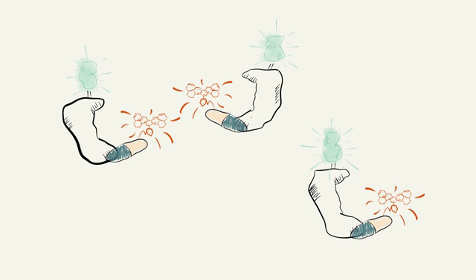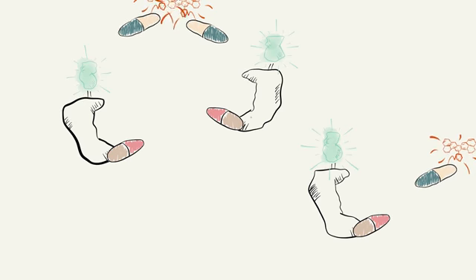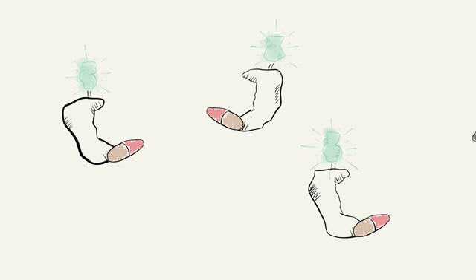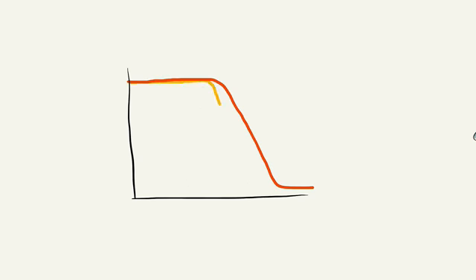However, if we introduce increasing concentrations of a drug that binds to the same target, we are able to compete with the tracer, resulting in a decrease in NanoBRET. This allows us to measure the affinity of the drug to the target. It also allows us to compare the relative affinities of different drugs to that same target.